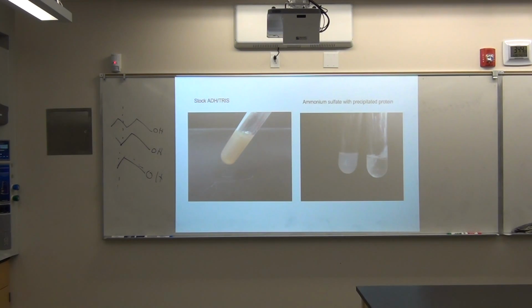But it was interesting that when they took the stock solution, they actually diluted it 1 to 3, and they ran the exact same experiment, and they got more ADH, and it was more active from the diluted stock material. We didn't have time to go into that, but I told them this is going to branch off and take on a life of its own. Yeah. And this is one of the really intriguing things, because that goes against all logic. You shouldn't be able to salt out more active and better quality protein from a dilute solution than a stock solution, which should have more of the ADH.